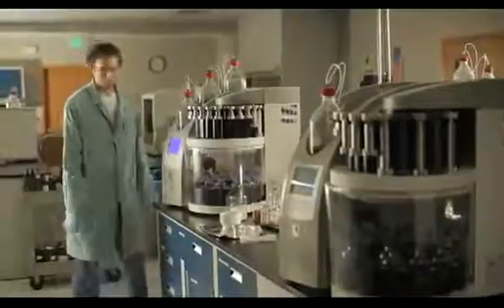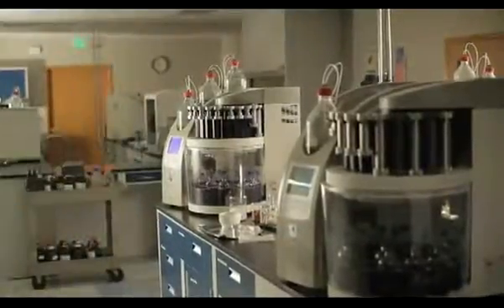The ASE system also gives you walk-away automation. The system does all the rinsing and solvent switching, resulting in faster method development.